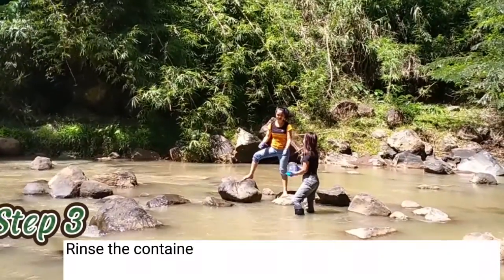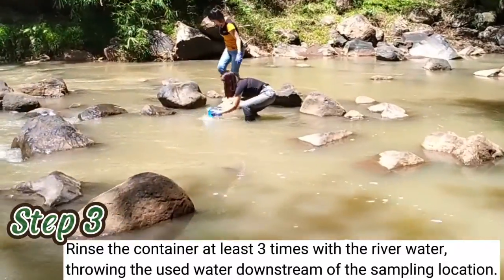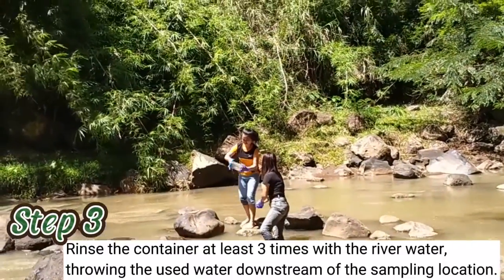Step 3: Rinse the container at least three times with the river water, throwing the used water downstream of the sampling location.